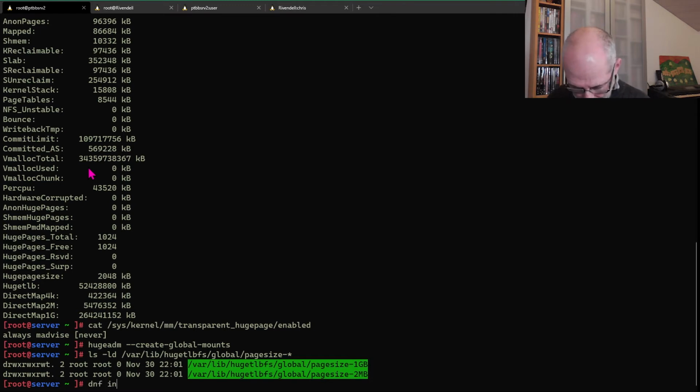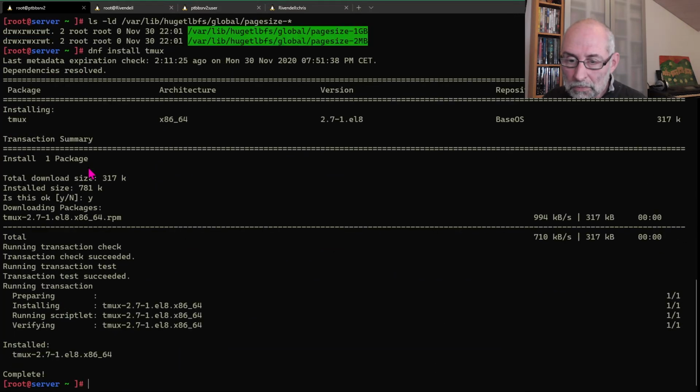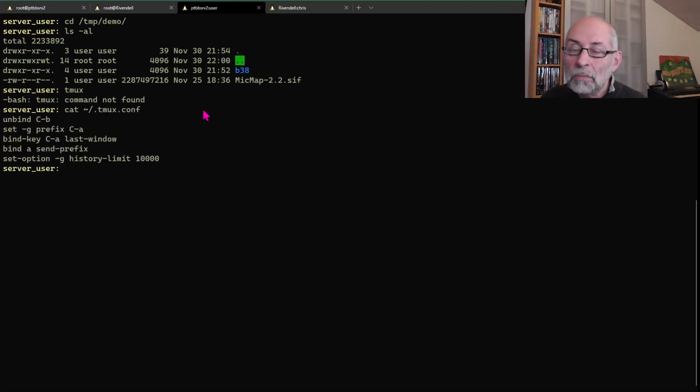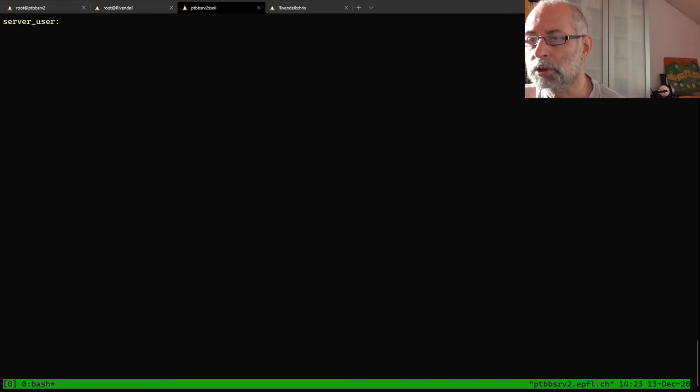Missing. I prefer to set it up like screen. Okay, so we have the tmux going, so we can now try to test if things are working properly.